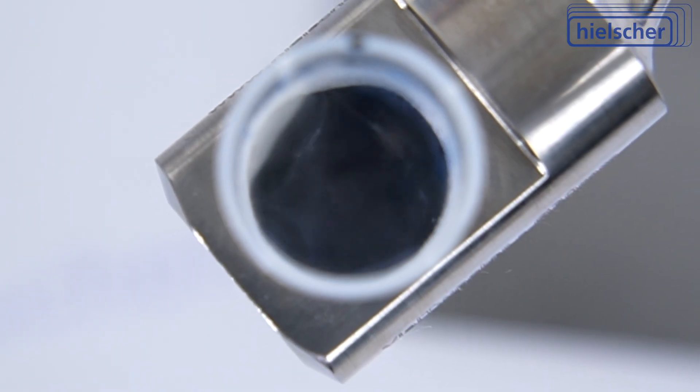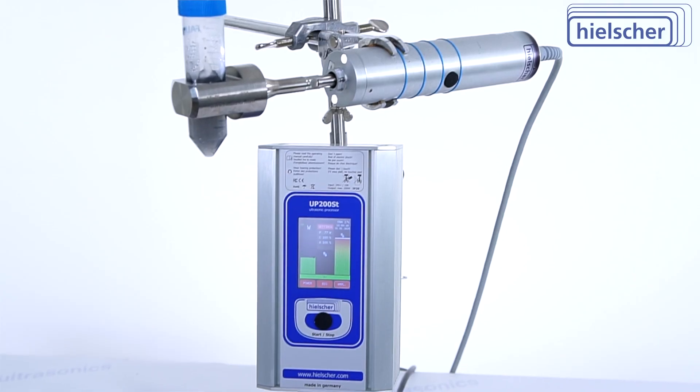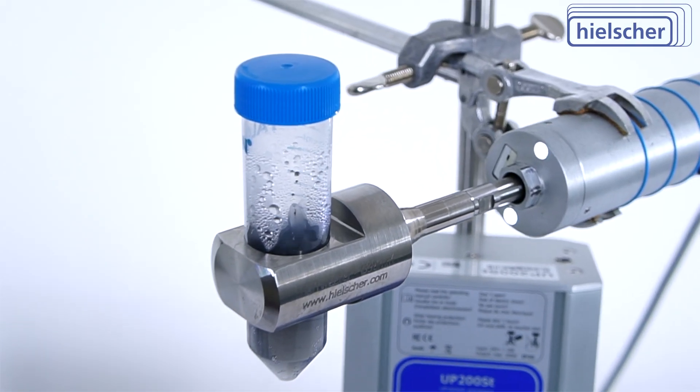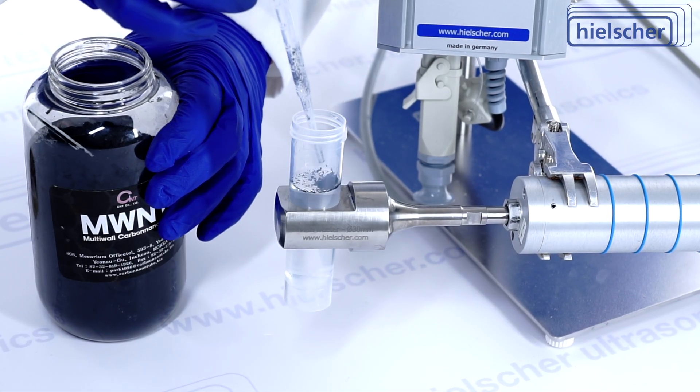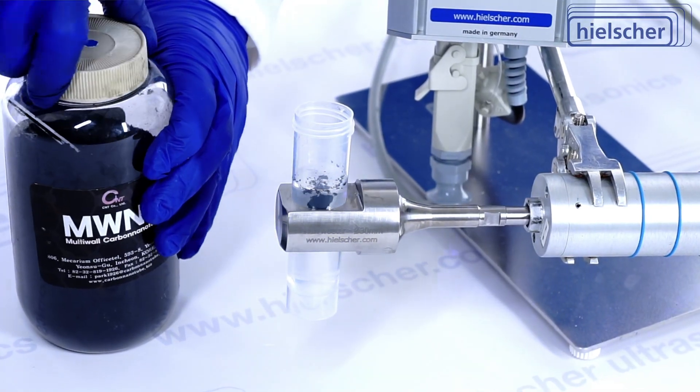The Vial Tweeter's ultrasound intensity also excels at nanoparticle dispersion. Metal oxides, carbon nanotubes, or polymer-based particles often form tight agglomerates. Inside a sealed falcon tube, the focused ultrasonic cavitation breaks these aggregates into uniform suspensions.